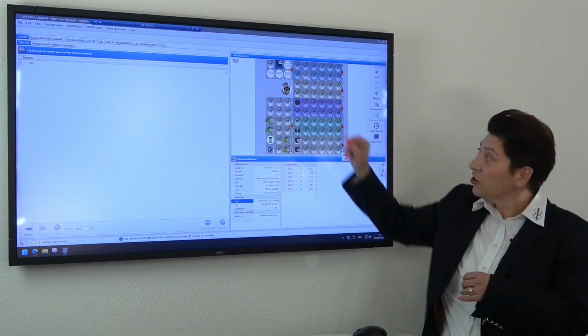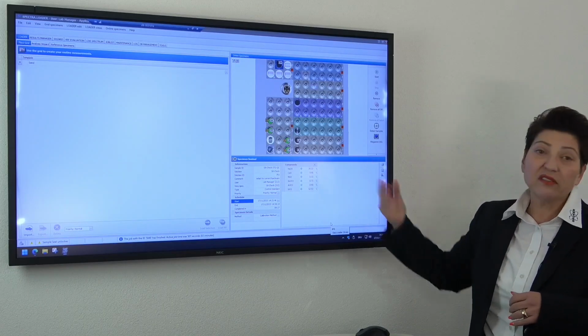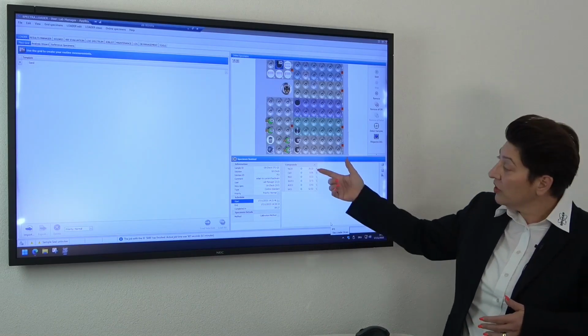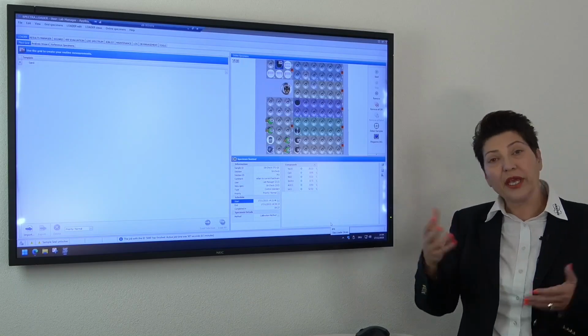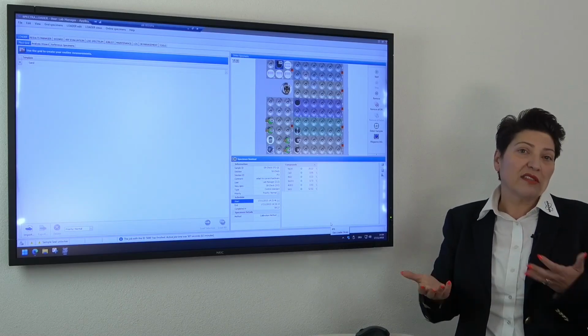The sample is finished now, and the results are shown here in this results window. This is now a check sample, which is predefined by us, so this sample has specifications. And as soon as the sample is within the specification, it's shown with green dots. In case the sample is out of specs, it will be shown in red dots, but you can also change the color codes, so it's customizable.